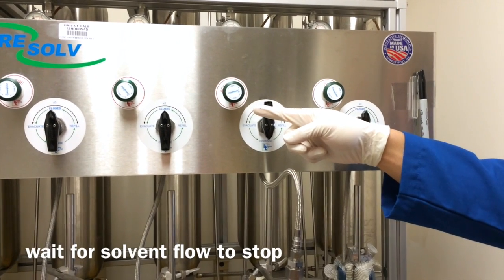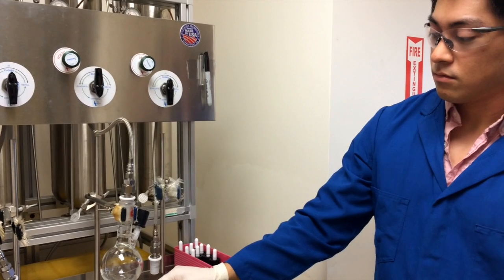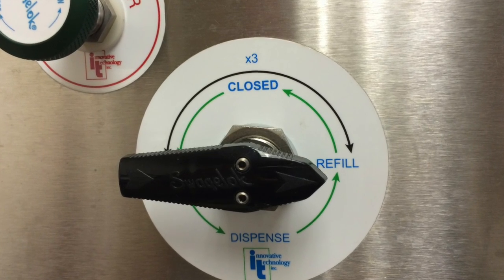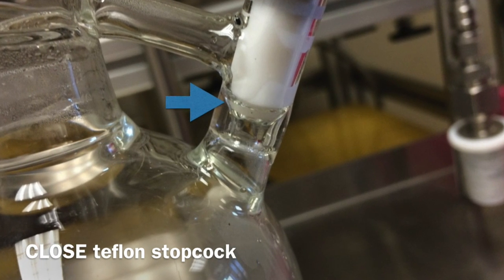Wait for the solvent flow to stop. Then, from dispense, turn to refill. This refill step will purge the line of any remaining solvent. You can now close your Strauss flask. Note the distorted white line.